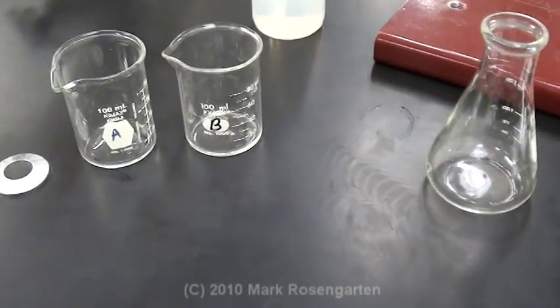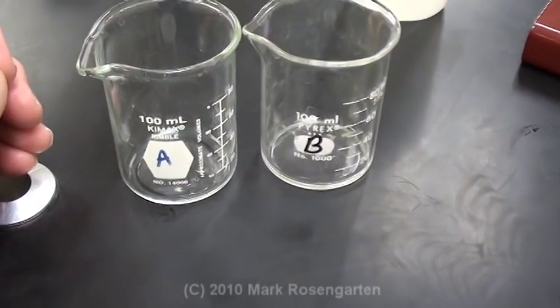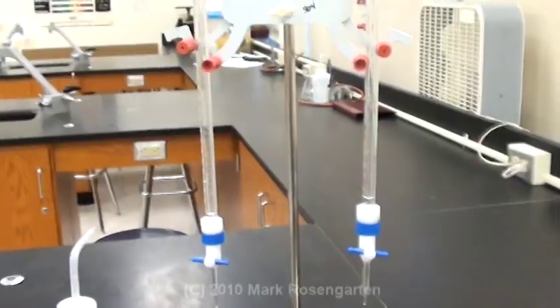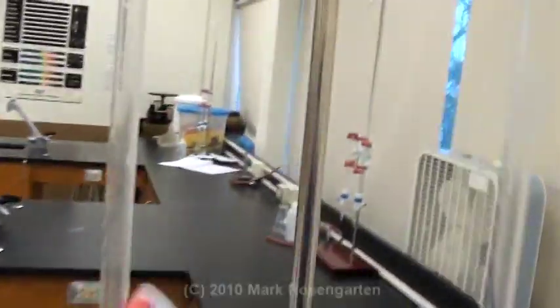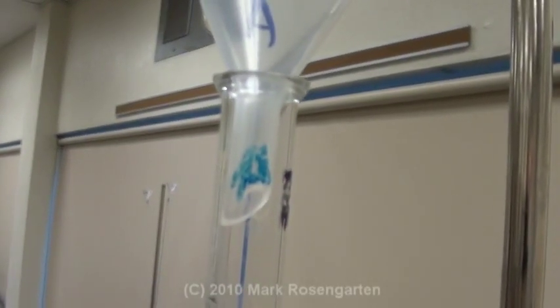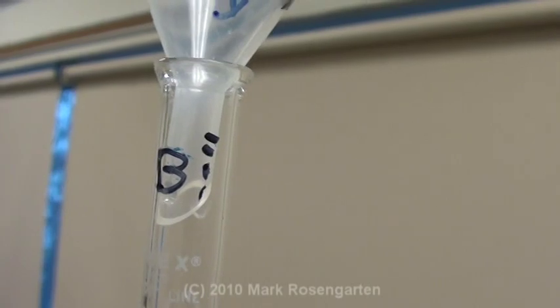The equipment you need to make this lab work are two beakers, one labeled A for acid, the other labeled B for base. Two acid-base burettes, one labeled A for acid, the other one labeled B for base.